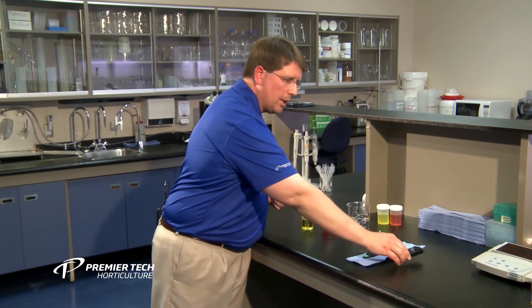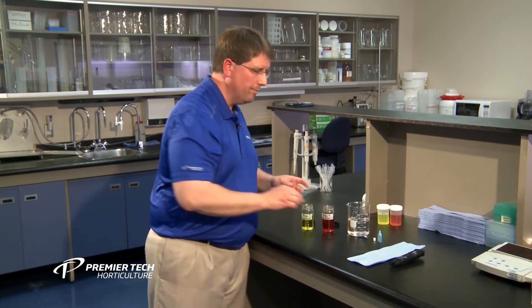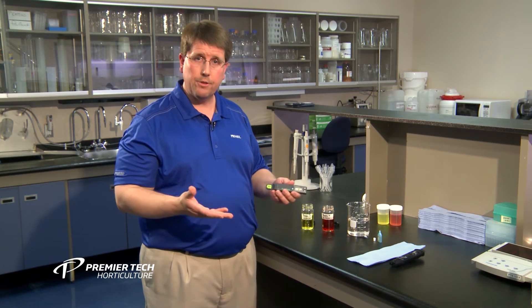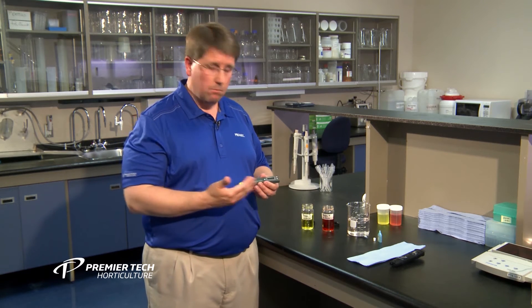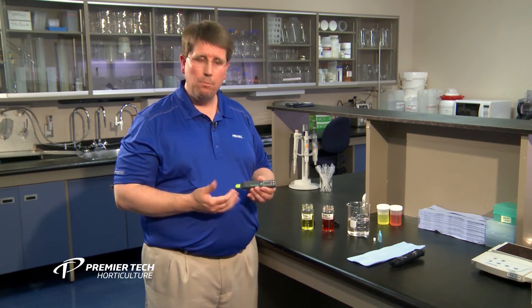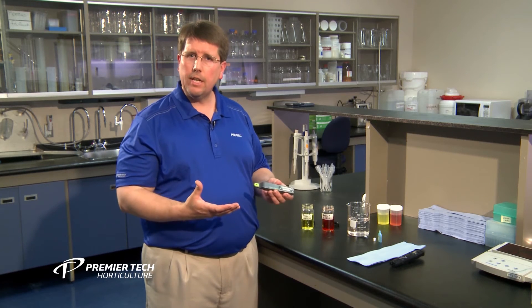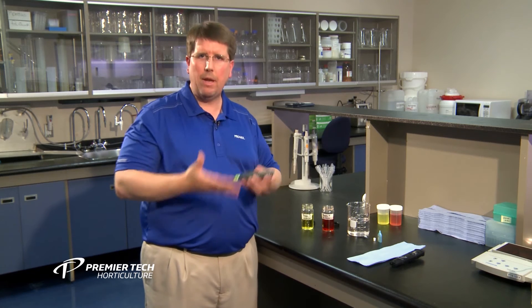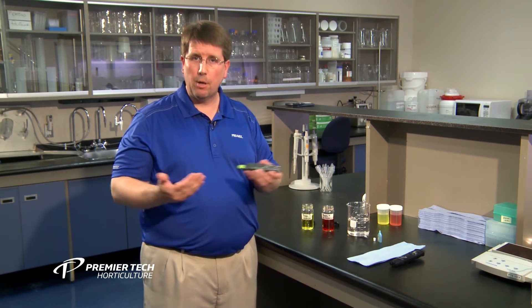The second one we want to talk about is our EC meter. EC stands for Electrical Conductivity. It measures the fertilizer salts or any other salts coming from your water. There are a lot of different ones on the market as well. Most of them are the pen type — fairly easy to use and generally one-point calibration. Again, we recommend getting an EC meter that requires calibration.